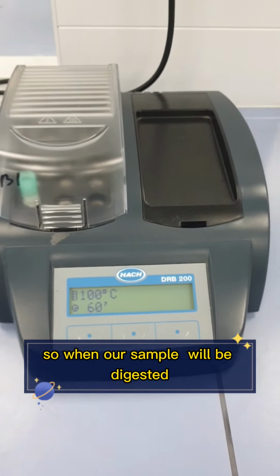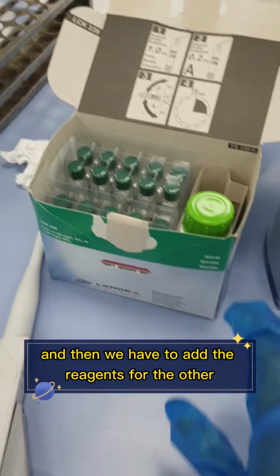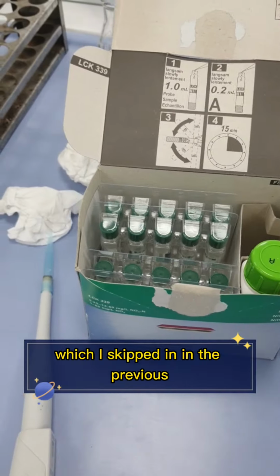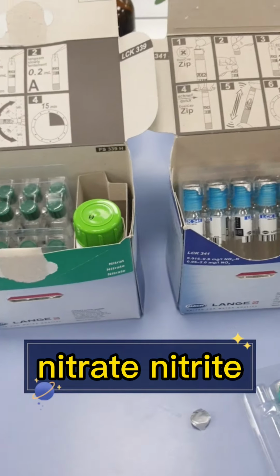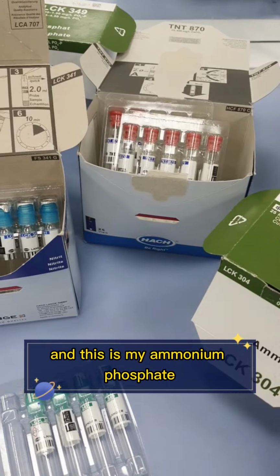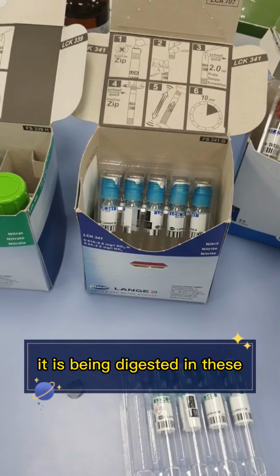So when our sample has been digested, we have to take it out, cool it down, and then we have to add the reagents. For the other, this is nitrate, which I skipped in the previous session. So I'll just be adding this nitrate also. So we'll be finding out nitrate, total alkalinity, and this is my ammonium. Phosphate is already going. Okay, it is being digested.